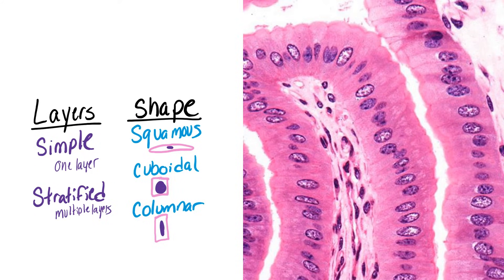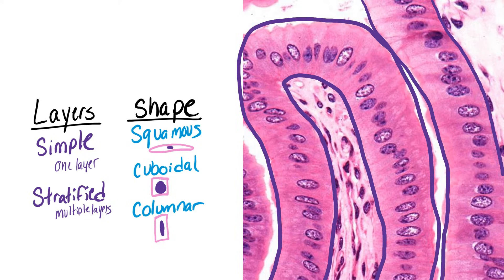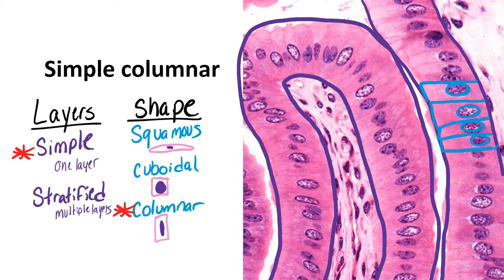Here, we once again have multiple single layers of cells, so it is simple. And when we look at the shape of those cells, they are very clearly little rectangles. And if you couldn't see the little rectangular shapes, you still see those oval nuclei, which tells you it is simple columnar.